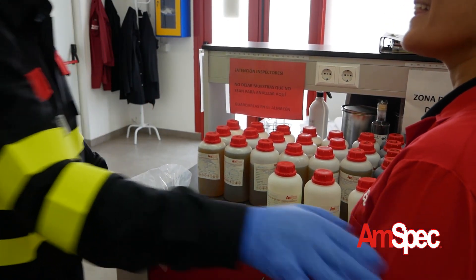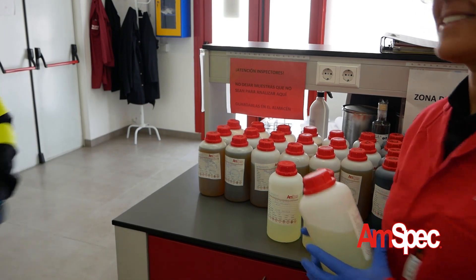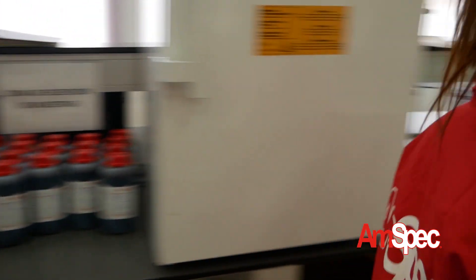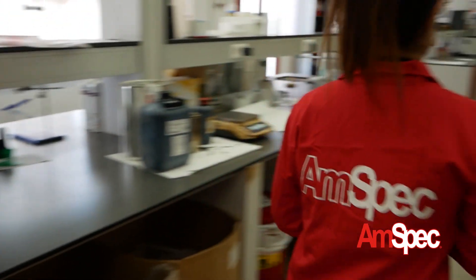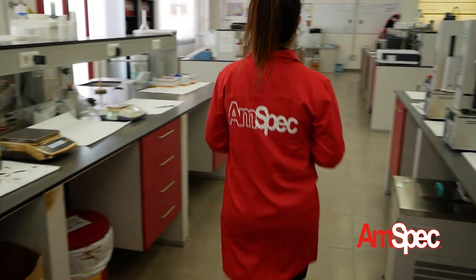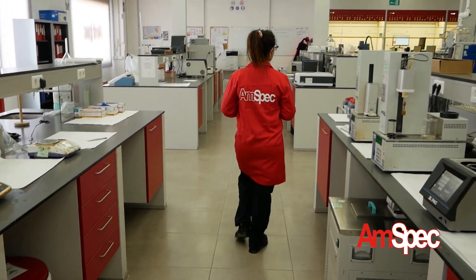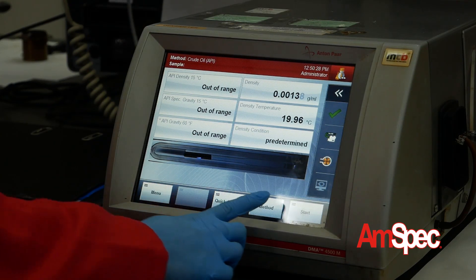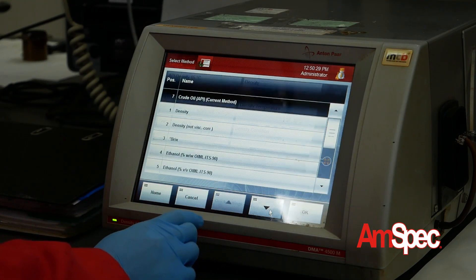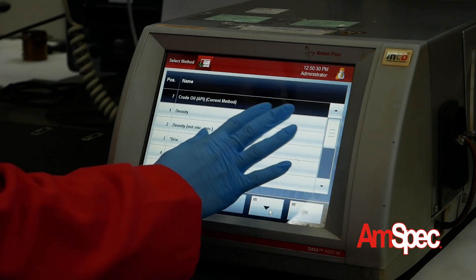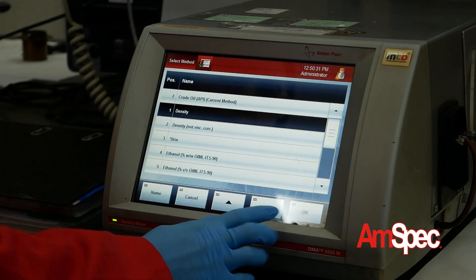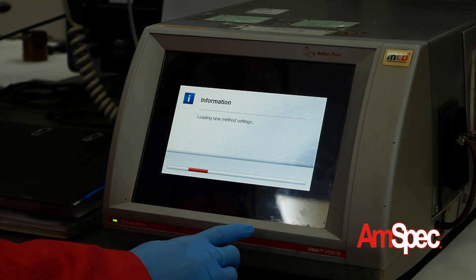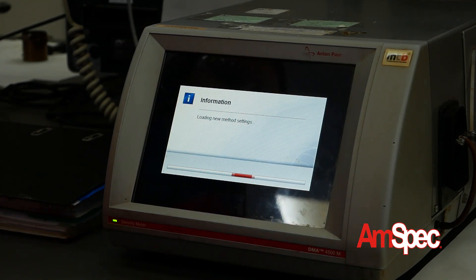The equipment can be pre-programmed for the specific method requirements for each product type, which for this particular equipment is as follows. The method density is selected in the equipment, which is measuring the density at 15 degrees C.